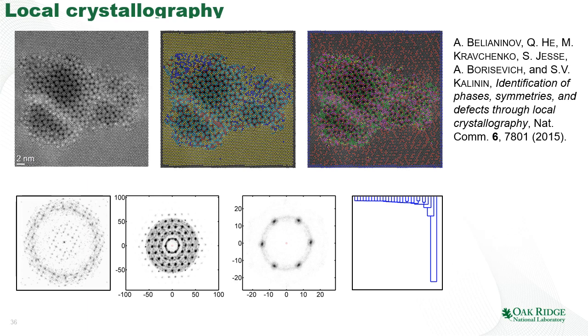So to do that, we find all the atoms in this data set. We define the radius vectors, so the chemical neighborhoods, and we perform k-means clustering of this data. So once we do that, you can clearly see on this dendrogram, so this is our initial cluster, and then we start to separate the atoms into two groups, three groups, four groups, and so on.